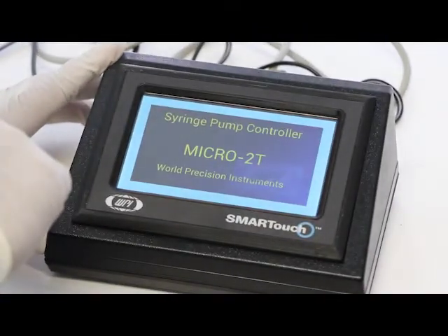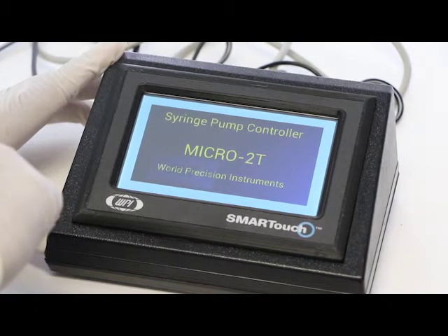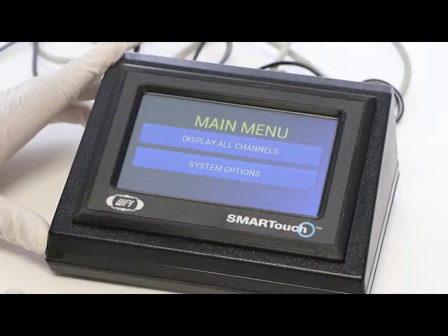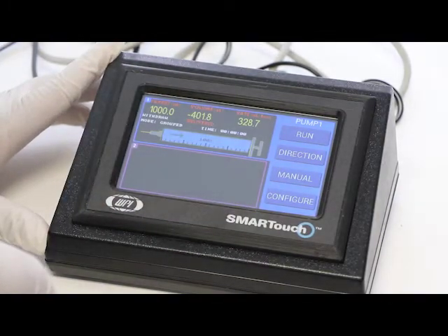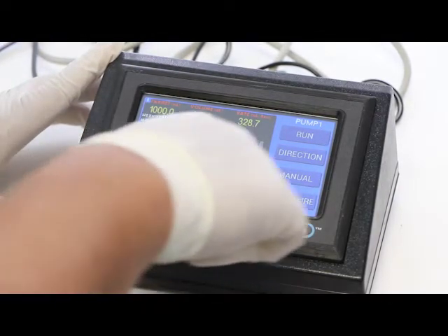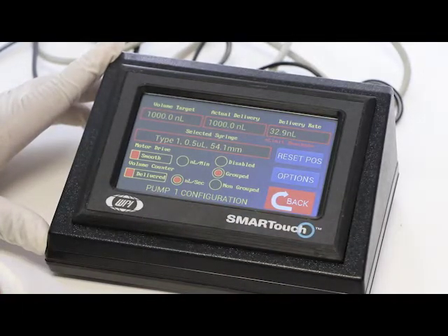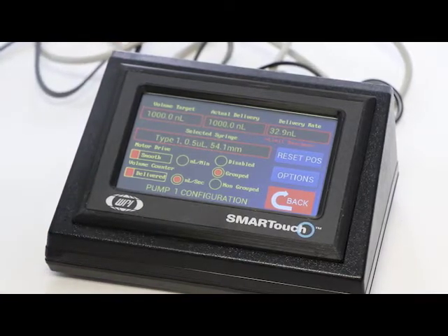Now we're going to show you how to set up this controller to work with the nano-liter injector. The first screen that turns on is your home screen and then you're going to go to your display or channels. And then you're going to hit configure. And the first thing that you should do is to make sure that you selected the correct syringe or the nano-liter injector.